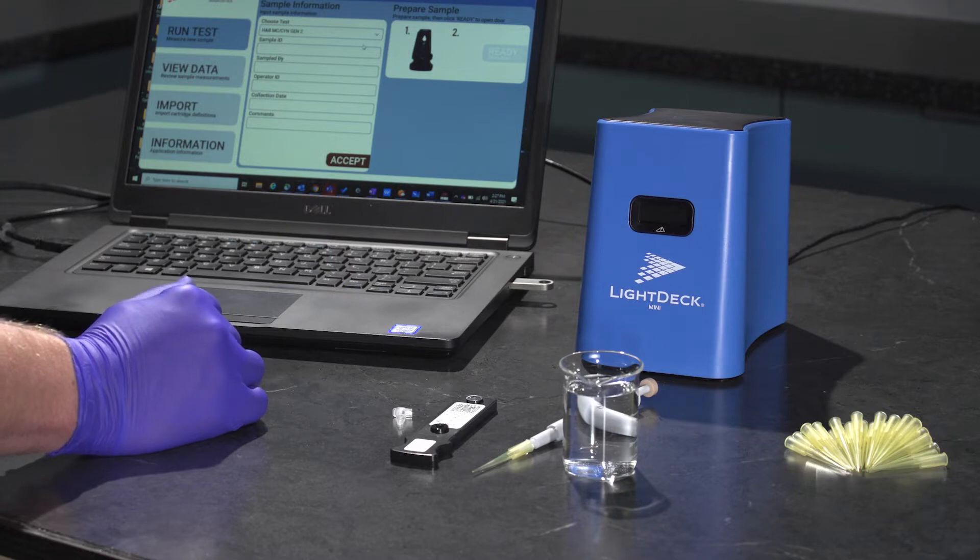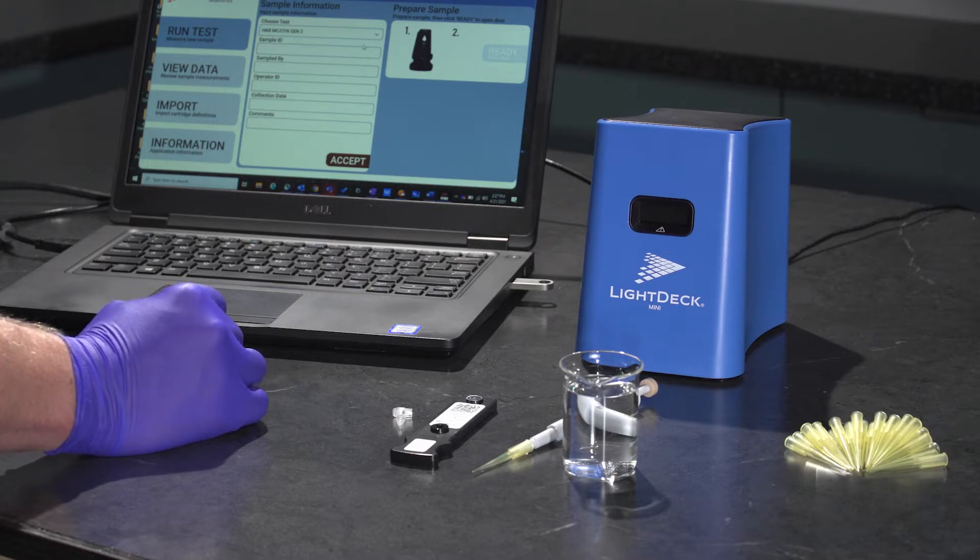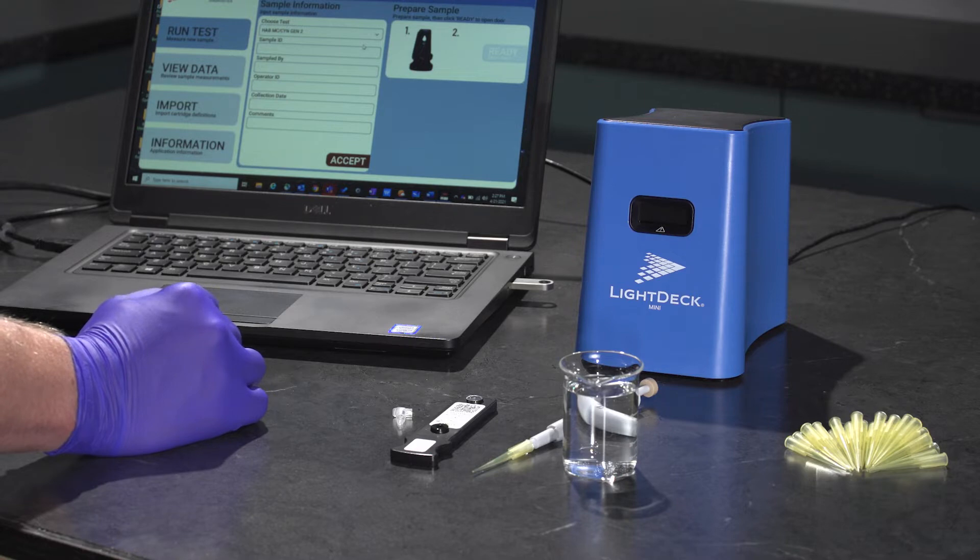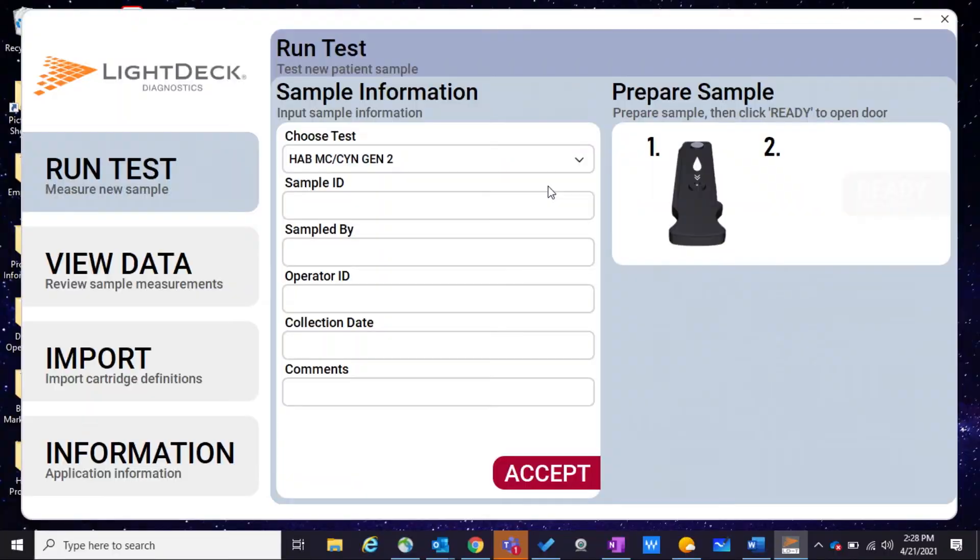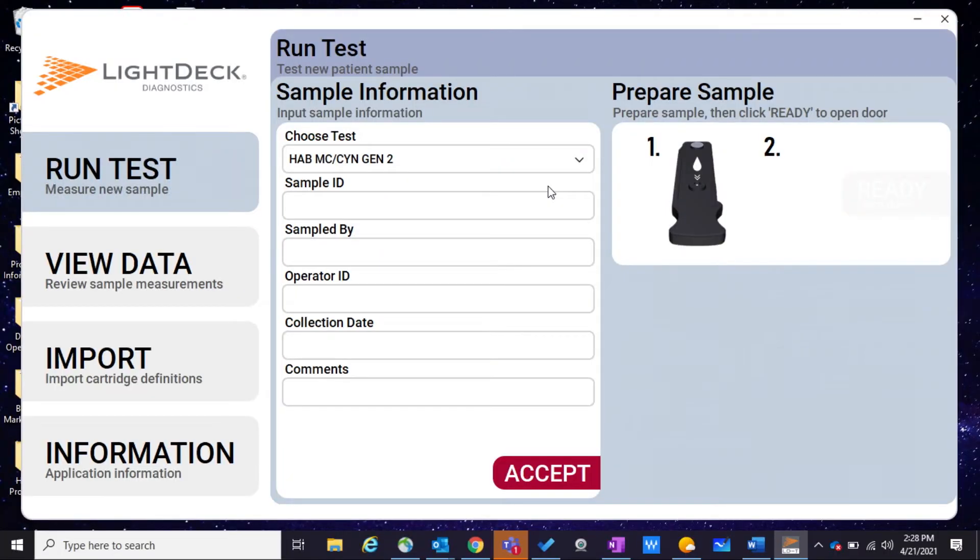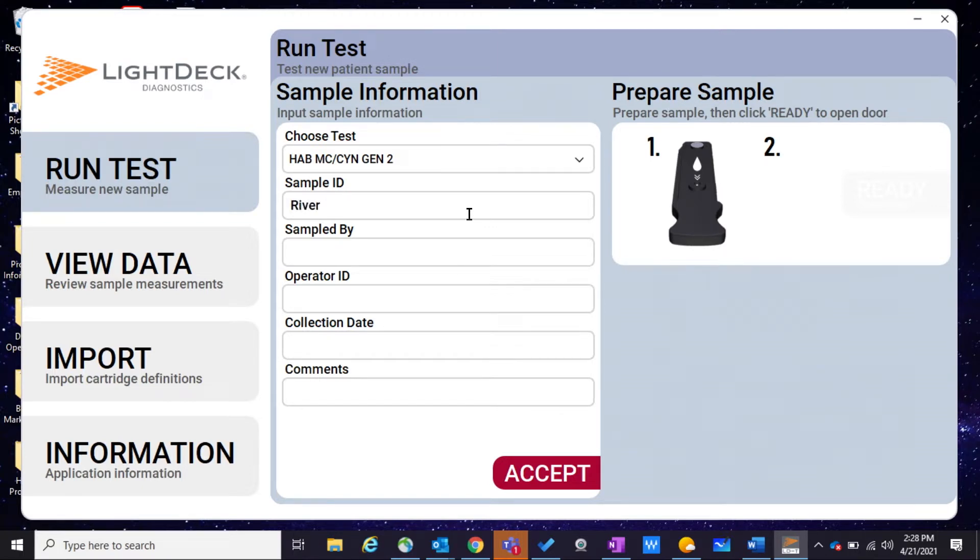Now we're going to put in the sample information. This is going to be helpful in making sure that we collect the right information on the particular water sample that we'll be analyzing for algal toxins. We're going to start with the sample ID, which could be anything for that particular sample. In this case, we're going to call it River 10.